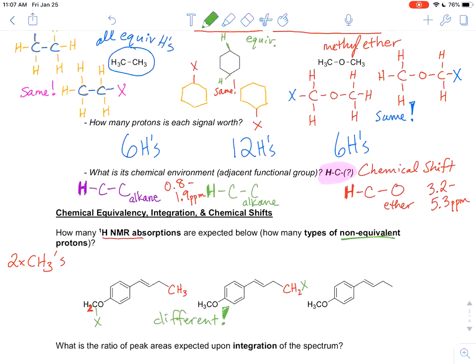They are different. The easier way of going about that might just be to say that this methyl group right here has an oxygen near it. This methyl group right there does not. So those are different. Okay. Great. So I'm just going to call those on this cleaner version over here signal 1 and signal 2 only because those are the first 2 that we identified. This has nothing to do with where they actually lie on the spectrum. I just want to keep track of how many there are. Okay, so let's restart.